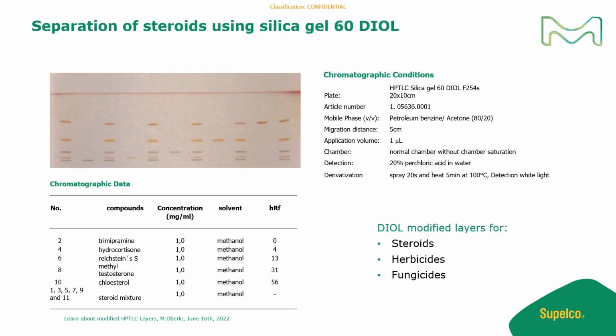Then I have another example on a diol modified layer, and here we have an example with steroids. Especially the diol modified layer is suitable for the separation of steroids, herbicides, or fungicides.